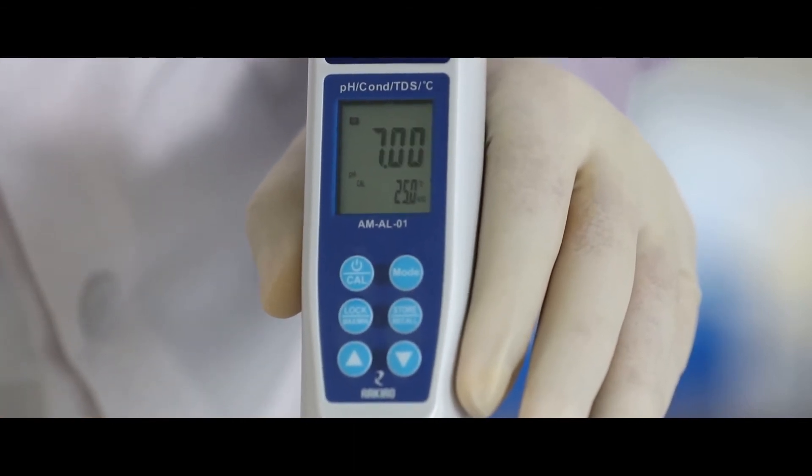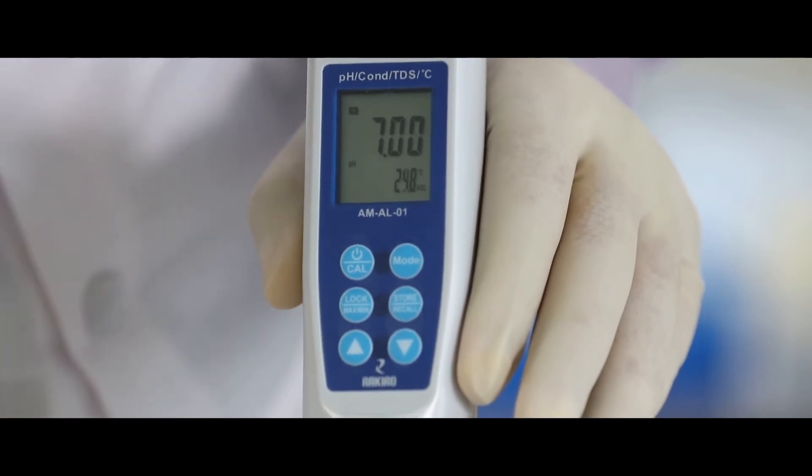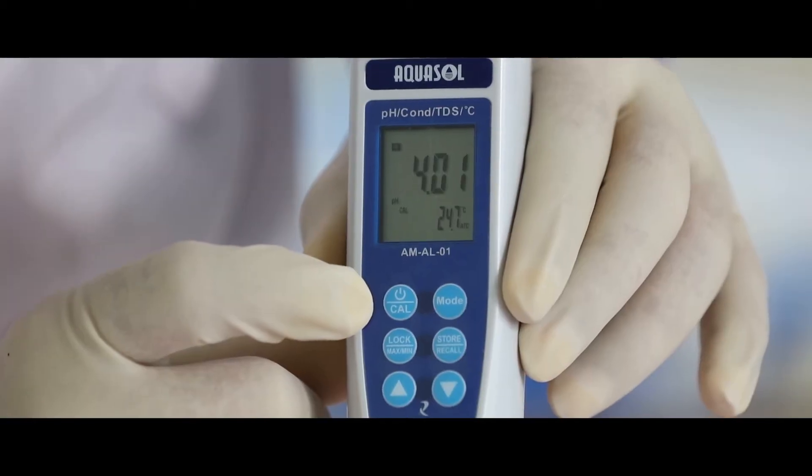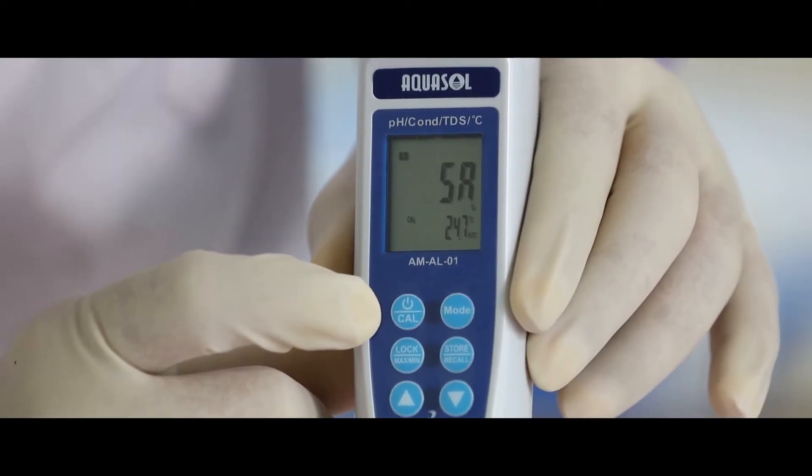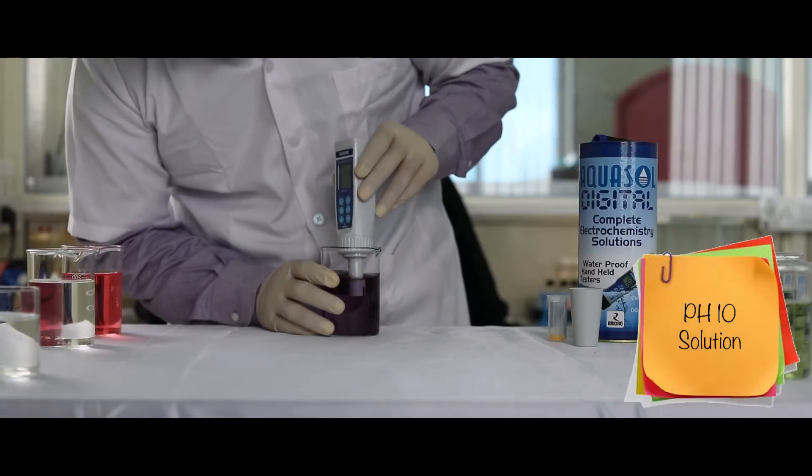Once calibrated, the device will display SA and END. Repeat the procedure for pH 4 standard solution and pH 10 standard solution. Rinse the electrode after each calibration.